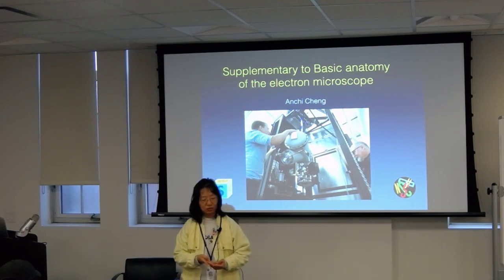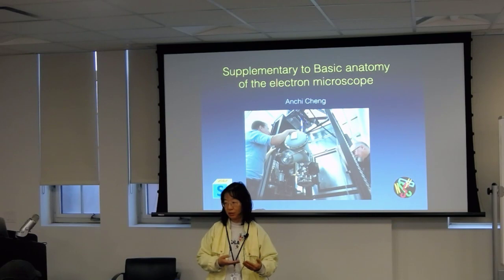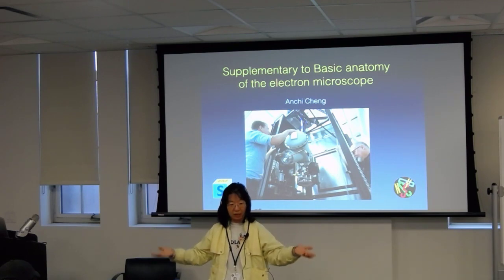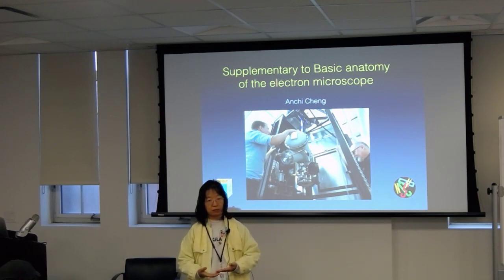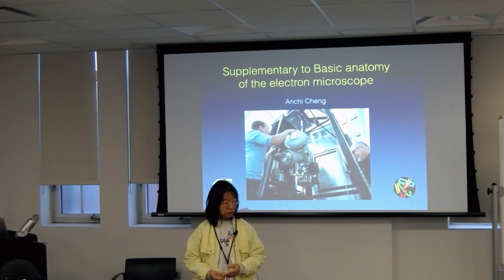Okay, so I hope that you guys spend some time to actually see what's there, because it's not necessarily just the cryo microscope that's going to concern you, if you get to the high-end scope. There will be other scopes that you will be using along the way, and it's good to know what the limitation of each one is and what you can do without having to spend a lot of money or time on something that is very hard to get on.